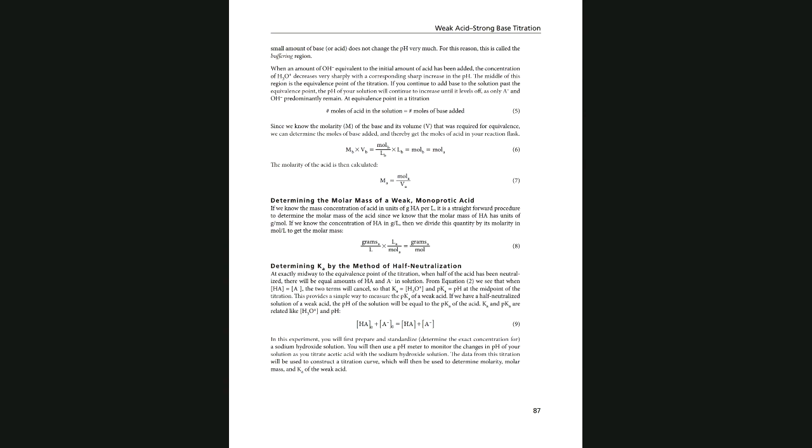So we find the concentration for the sodium hydroxide, then we are going to use vinegar as the weak acid to titrate with our new standard, which is the new sodium hydroxide. We have standardized it already. And then we find the concentration.